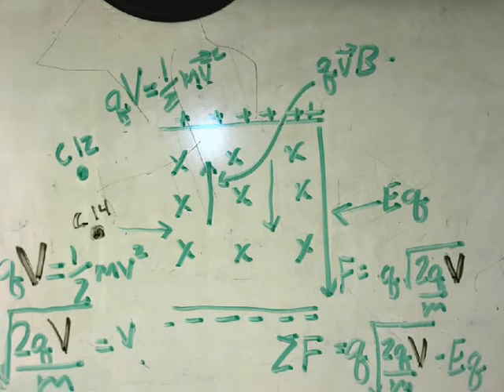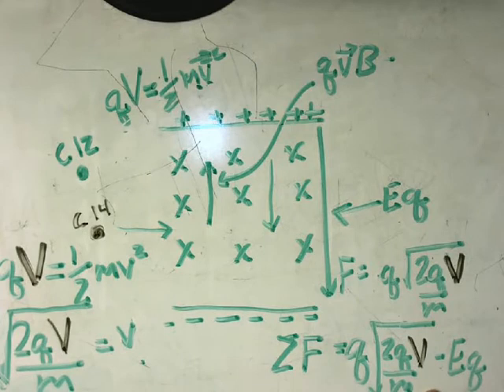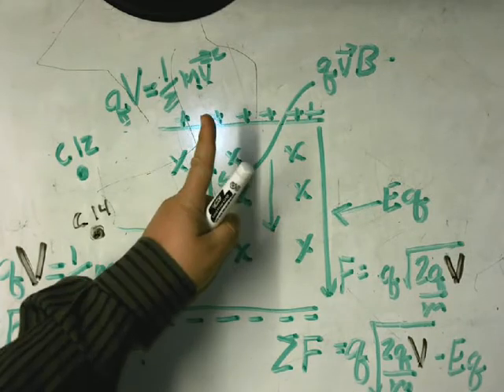Mass is now playing a key component of how much force that object is experiencing. Now, if I have it set up inappropriately, if I don't have the right value here, then if it's not the right mass, this force is going to be big. And if it's bigger than EQ, you end up getting more acceleration in this direction.